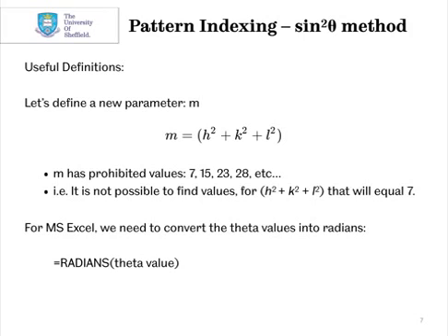The other thing to mention is that if you're going to do this in Excel, you need to convert your angular positions into radians, and you can do that by the equation on the screen here.